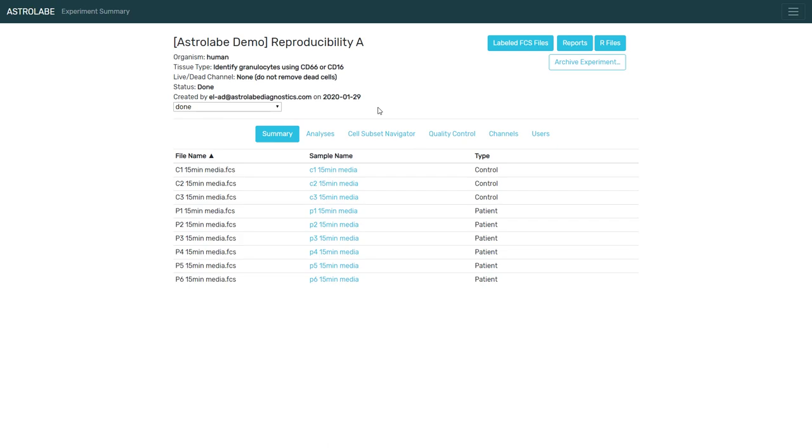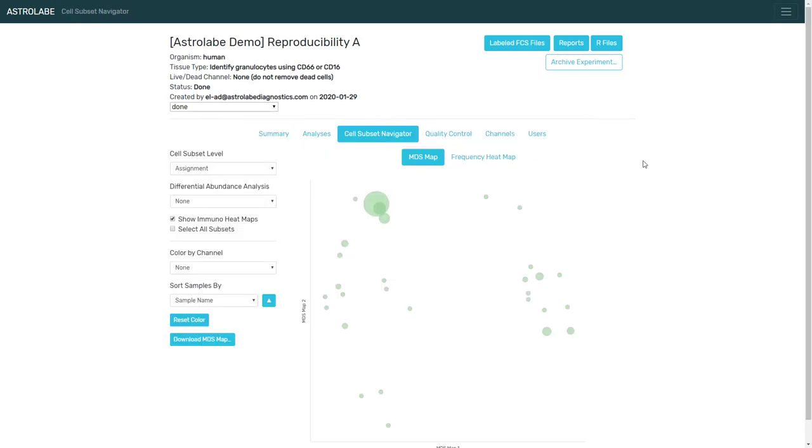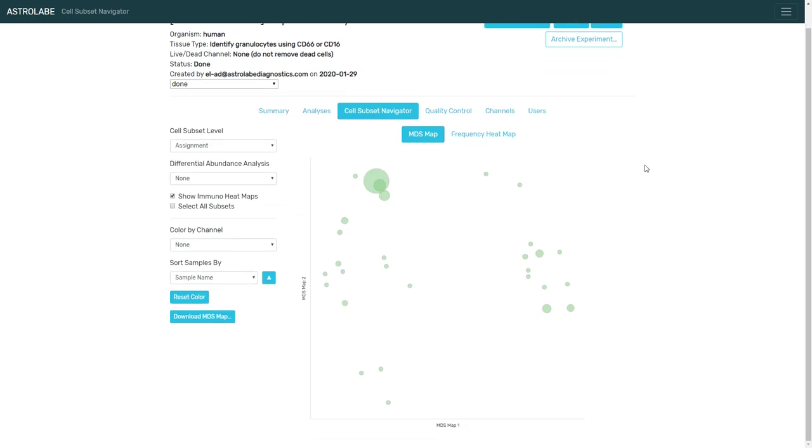And one of the tools by which Astrolabe helps us assess the phenotyping of an experiment is the cell subset navigator. This is a composite view of the entire experiment. It's a dimensionality reduction view.